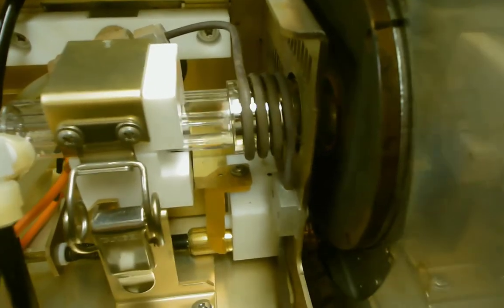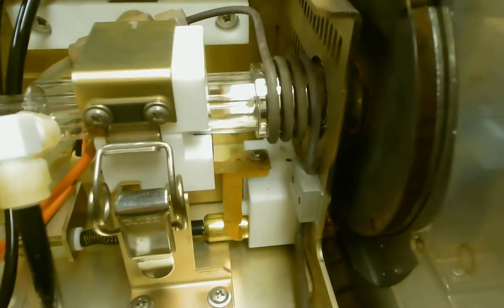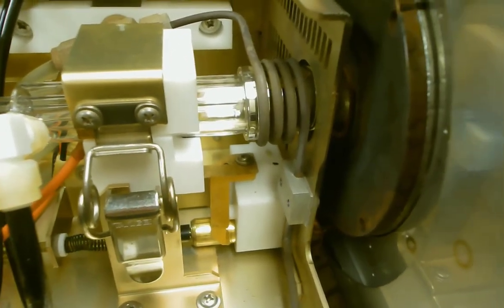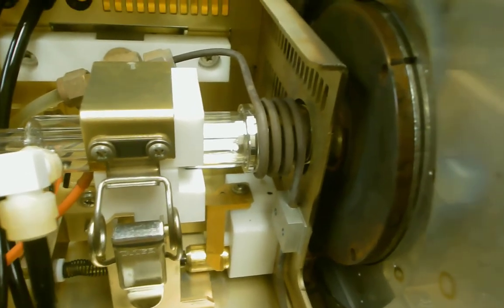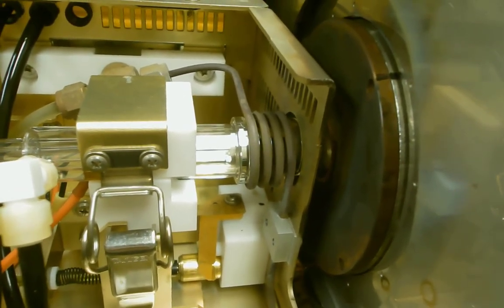And the coil right here applies the strong RF signal, which generates the plasma. So the plasma is an argon plasma. This uses around 20 liters a minute of argon gas.